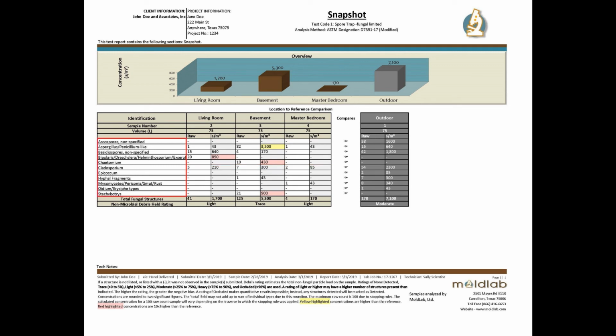Finally, realize that some mold spores are inherently more concerning than others. While many mold spores are commonly found in the outdoor air, some are almost never found in an indoor sample without an associated mold problem. Stachybotrys and Chaetomium are two mold types that will cause many mold inspectors to immediately conclude that there is a mold problem, regardless of how much of these spores are present.